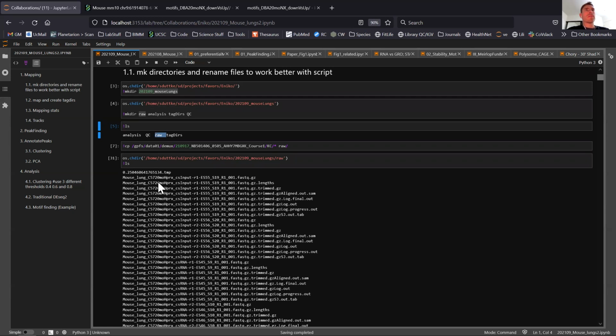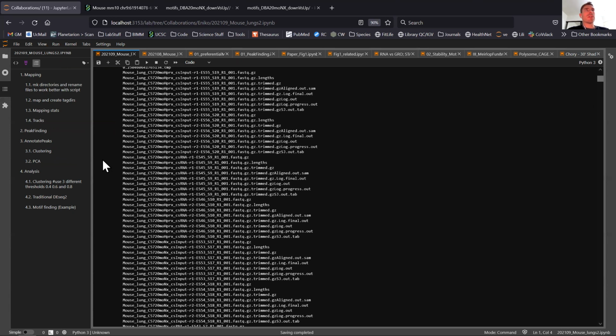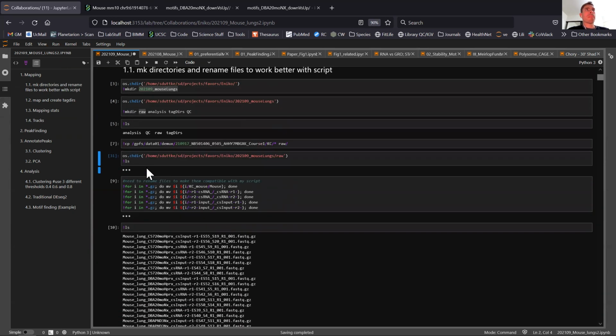So, okay, all the files are here and you see already what happened. This is because this is a bit out of order. So let's ignore that for now.